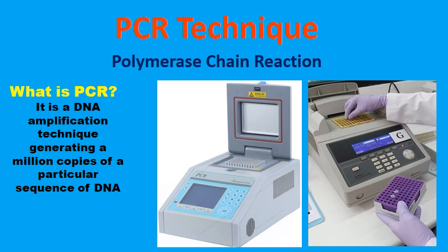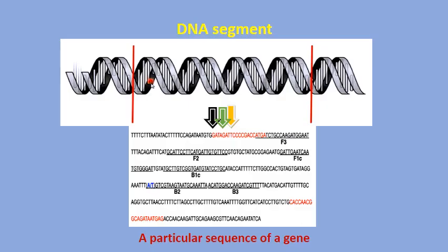This device is used to determine and amplify the sequence of a specific gene. We extract DNA from a human cell or any organism, and we are interested in a particular gene or a particular sequence of DNA.